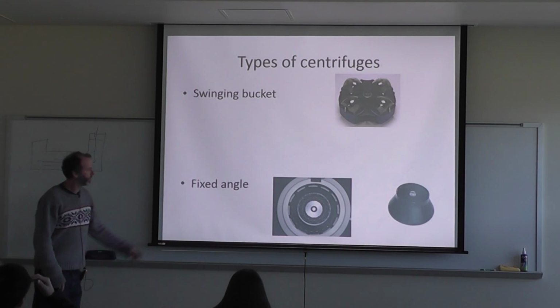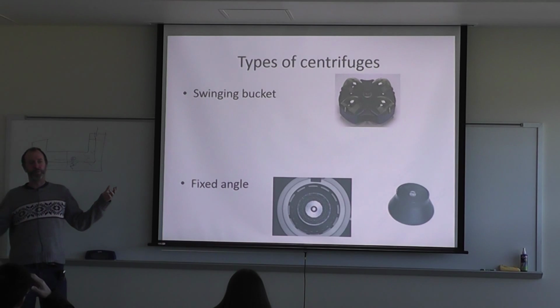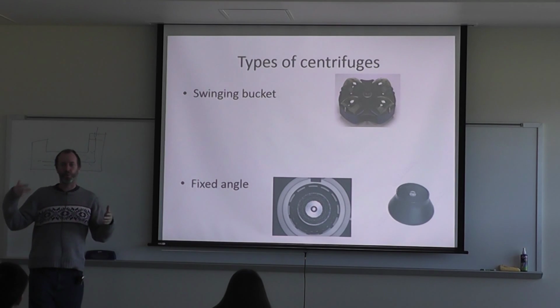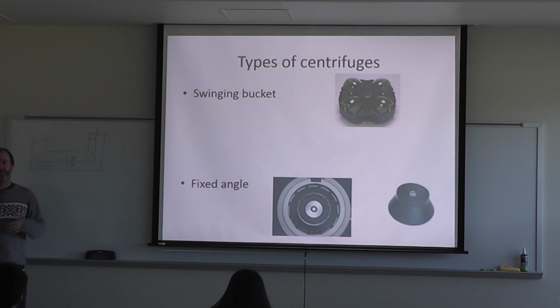So who here knows what the units are if you're going to be writing a protocol that has centrifugation in it? RPM? No. Jeez. Yes. And that it's relative force, or relative centrifugal force to gravity. So it's the number of times gravity the force is. So that question is also on a test, and everybody always gets it wrong.